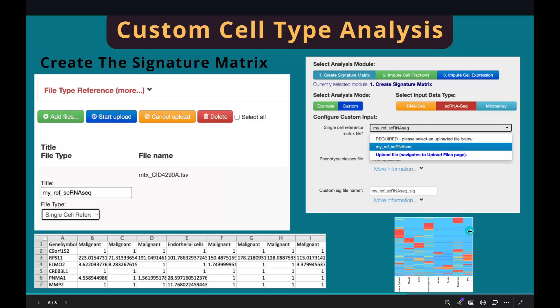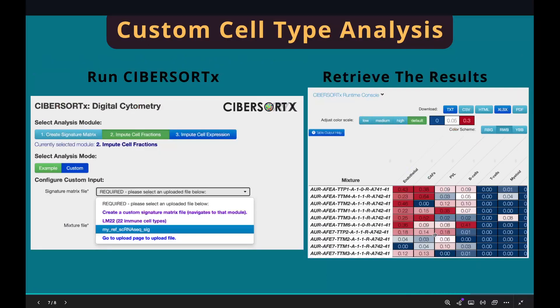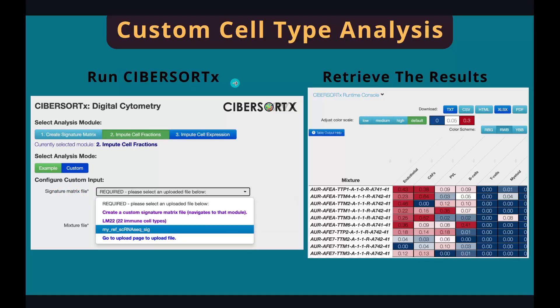The heat map shows the signature genes in our dataset. Once we have the reference single cell signature, we can select it as the signature matrix file in the Run CybersortX page. The mixture file is still our own bulk RNA-seq dataset. After a couple of minutes, the web page will bring you to the result page, and the results are stored in the same format and can be downloaded in various formats.